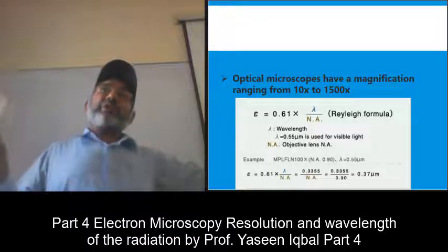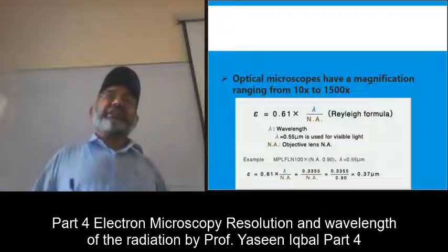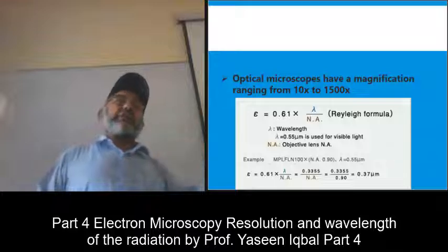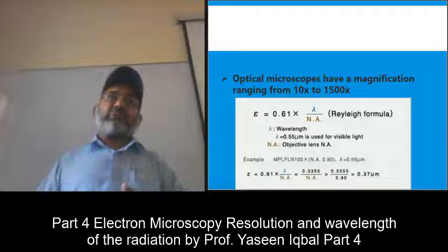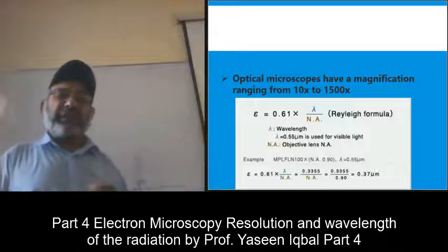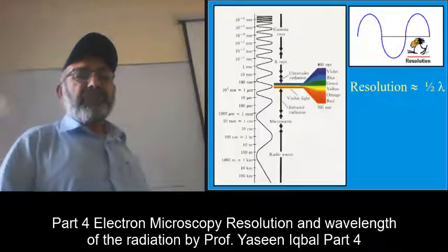So you allow some room for the electronics associated with the detection and transformation of the outgoing radiations, which are converted, for example, from analog to digital and from digital to analog. In this conversion, a lot of information is moved around a little bit, and that is why you don't get the specific resolution which is expected.